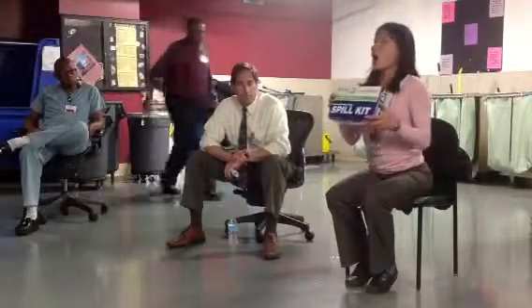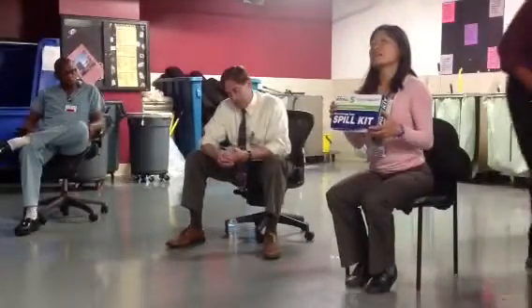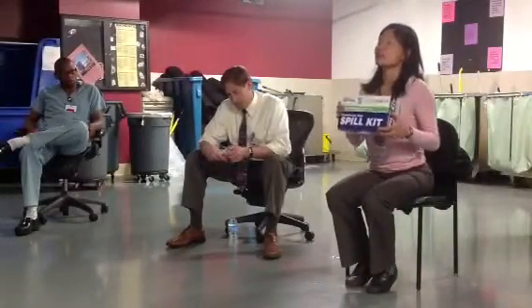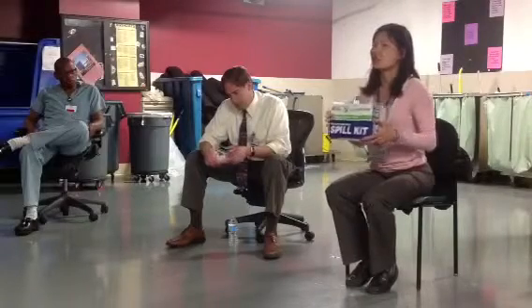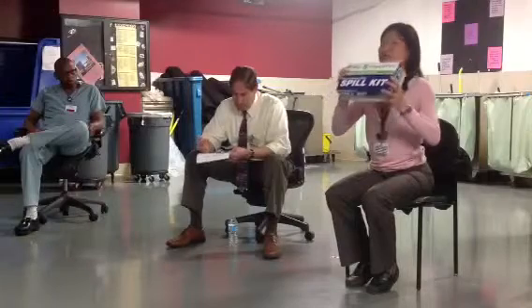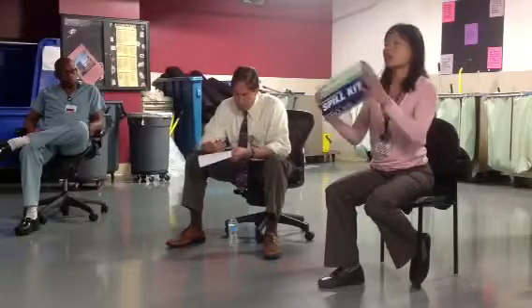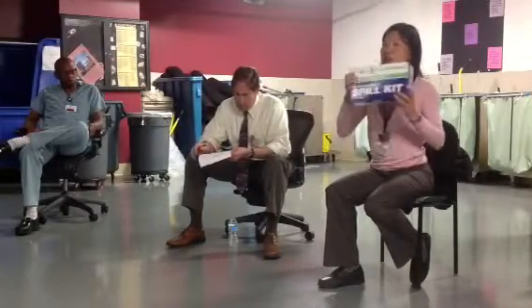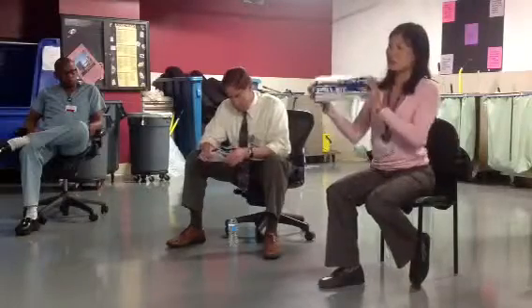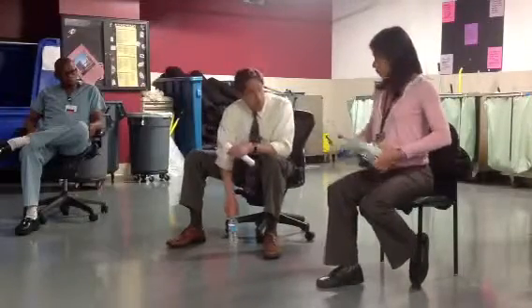If the spill occurs in the non-infusion center or short infusion center, very likely they have this kit already available because they handle a large volume of infusion in that location. They do have a kit very readily available in those locations. But if you ever need to get an extra one, Central Issues have one, and Yesenia will go to find a few more.